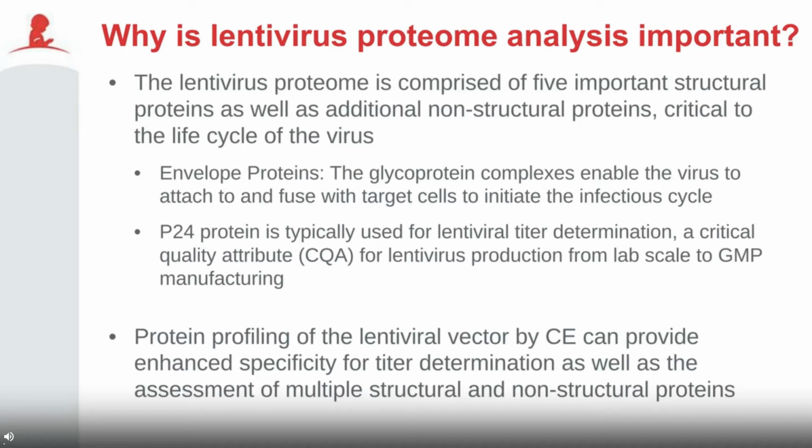So here we've developed a separation-based method for lentivirus protein analysis with 2 purposes. First, to provide the accurate titer determination of the lentivirus sample based on quantitating the separated P24 capsid protein without any interference of the other proteins in the sample. At the same time, the well-separated protein profile could be utilized for lentiviral protein purity assessment.